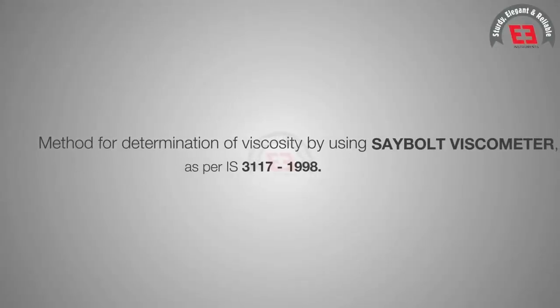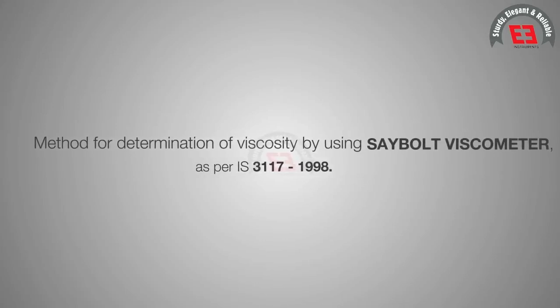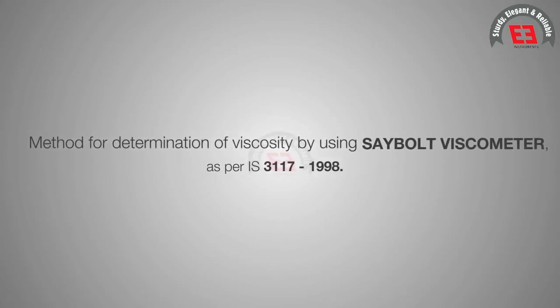Method for determination of viscosity by using Saybolt Viscometer as per IS 3117-1998. Introduction.